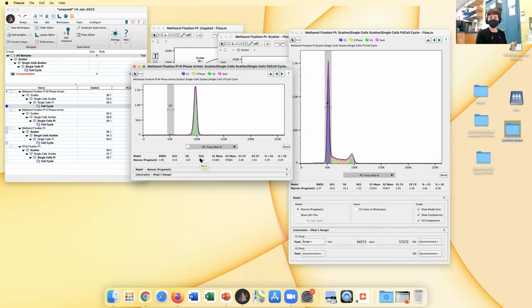And that's a more accurate reflection of what we're seeing with this treatment that we've applied to these cells, where the mitotic spindles can't form, and we're seeing this arrest in the G2M phase. So there's a lot of cool things that you can do with this software in order to be able to pull out your populations and fit your data, okay?